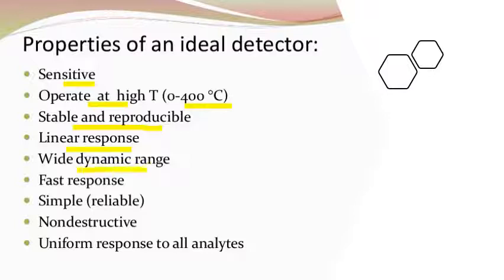Wide dynamic range. Fast response should be there. Should be simple, reliable, non-destructive, should not destroy the sample, and give uniform response to all the analytes. So these are the ideal properties of the detector to be used in the gas chromatograph.